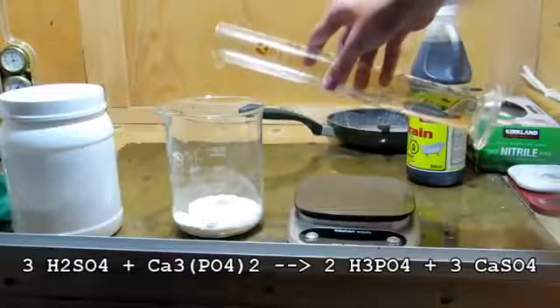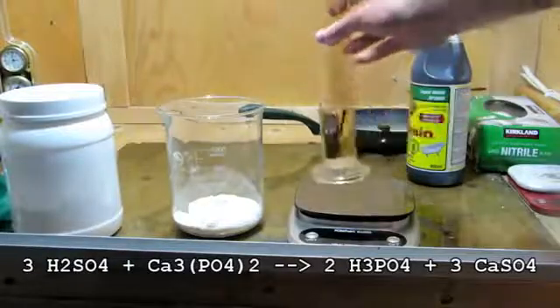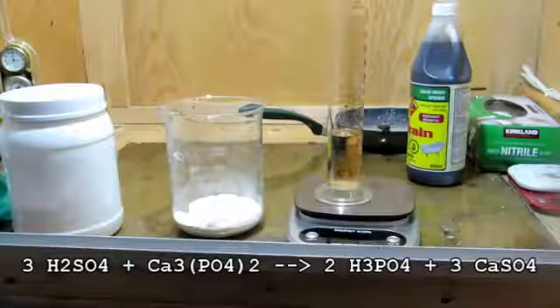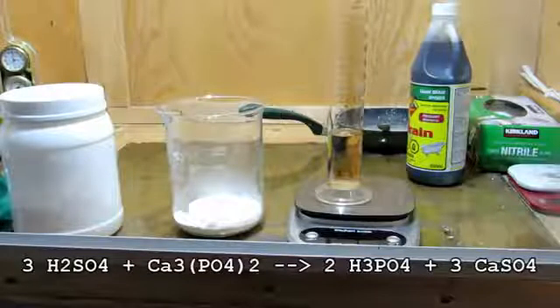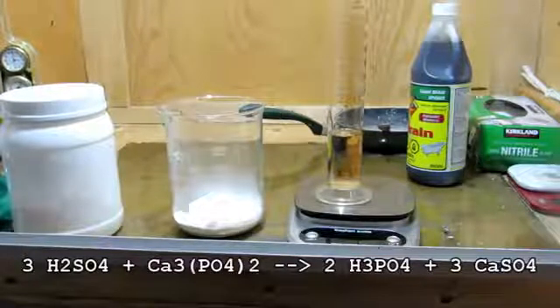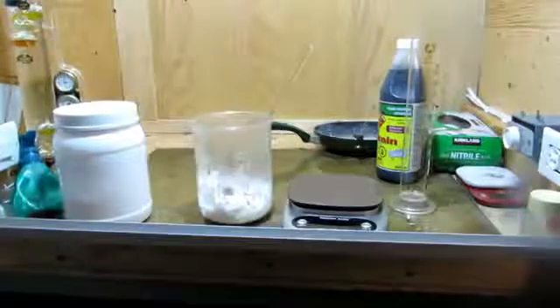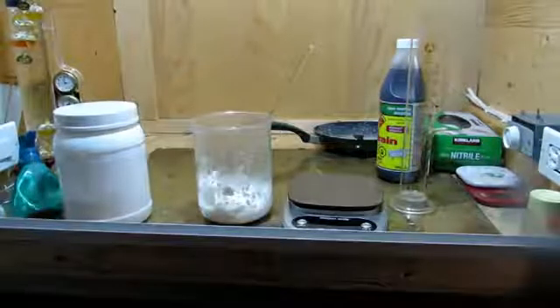So, as you can see by the addition of the sulfuric acid to the calcium phosphate, this reaction is very exothermic, as can be seen by the fumes. So, we'll mix this thoroughly, add some extra water to dissolve the phosphoric acid, and then we'll go ahead and filter the calcium sulfate.